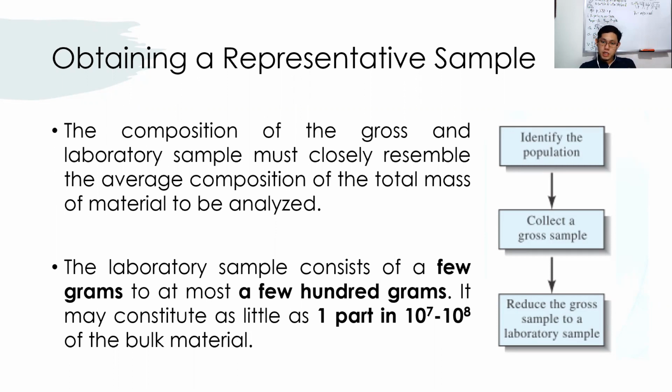Dapat ko ba siyang i-freeze drying para hindi magbago yung form ng analyte. Kasi di ba kapag nag-freeze ka ng material, it's possible dyan na-arrest yung chemical reactions kasi at lower temperatures, bumabagal yung conversion. So kapag nag-freeze dry ka, possible na hindi magre-react yung polyphenol oxidase to degrade your antioxidants or convert them into another form. So the laboratory sample consists of a few grams to at most a few hundred grams.